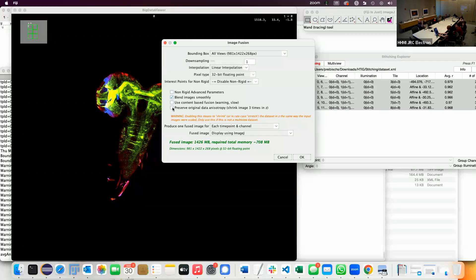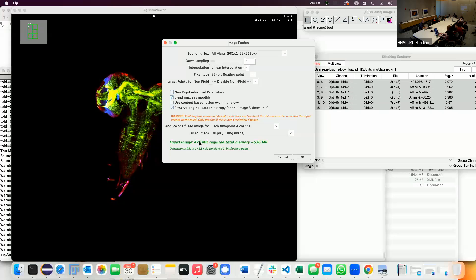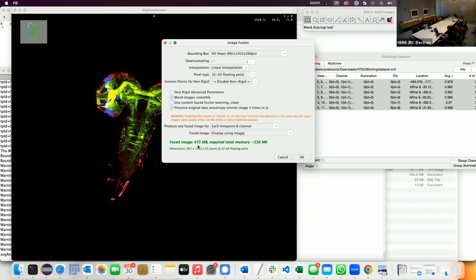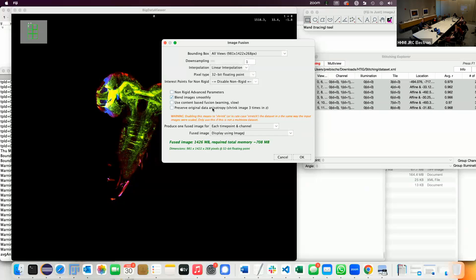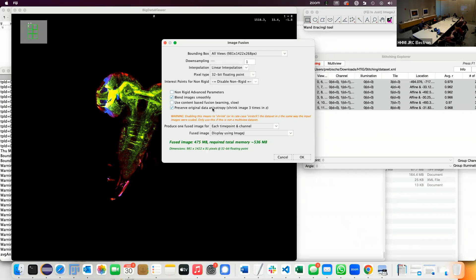This only makes sense to output isotropic if you have data acquired from two different orientations. There's a question: can you explain why the top bounding box is 900x1400x200 while the bottom dimension is different? If I click it updates. So is that from the initial guess or is it updated? There's no automatic update — that's what you put in. There's no way for the software to know from a single orientation what the actual scaling is. If you have multi-view data you can actually guess it, but with just one orientation there's no way to know.